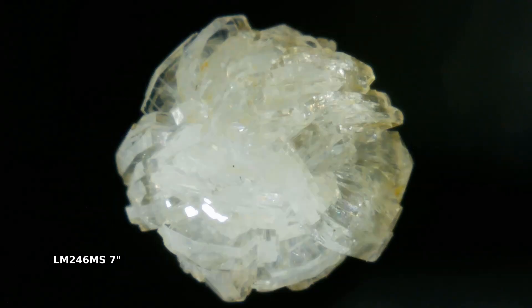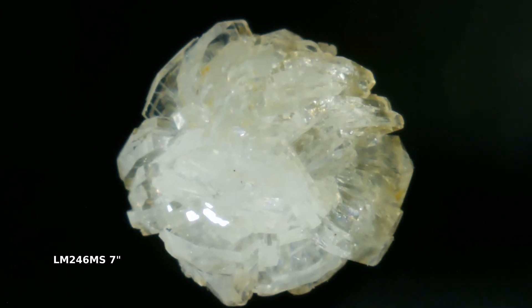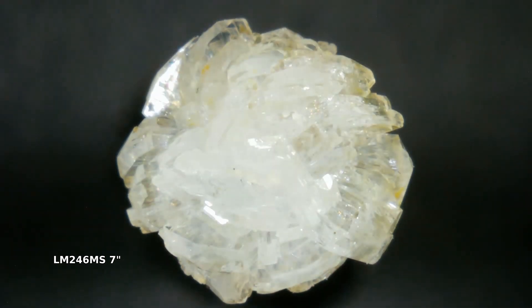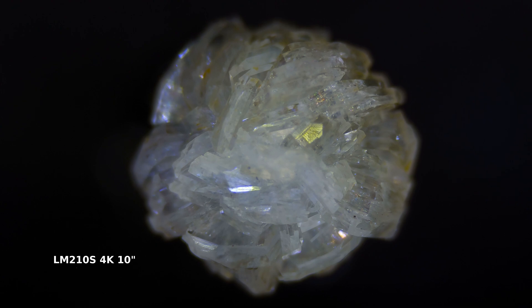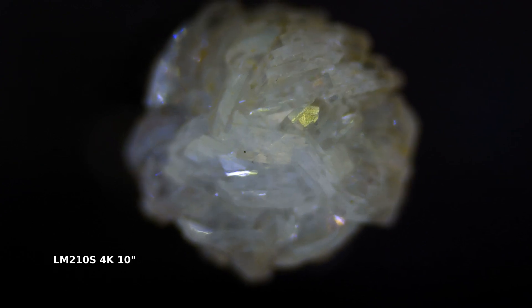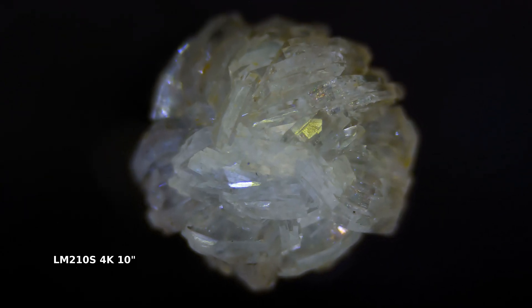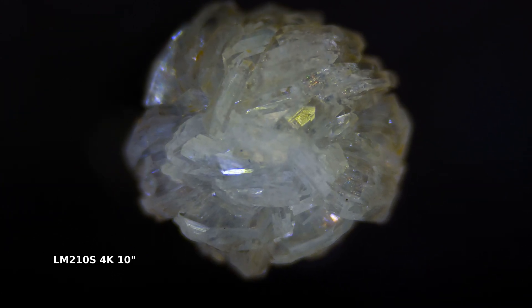This is hard on things that are very clear, like this piece of Clinoptilolite here. But we can still make out the structure with both of these — we can see the structure quite well, to be honest. However, the 4K gives us a lot more clarity. That more narrow focal depth is still an issue, and that's always an issue with my optical microscope as well — that's why we do image stacking. But we're not in that price range at all, so it's not a fair comparison.